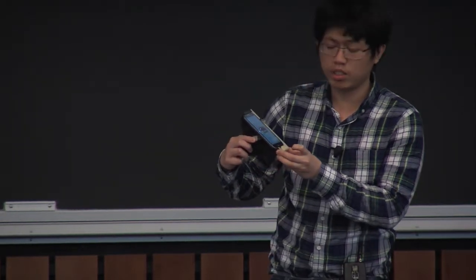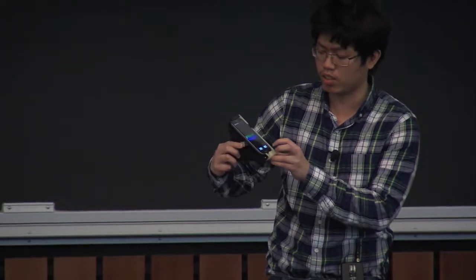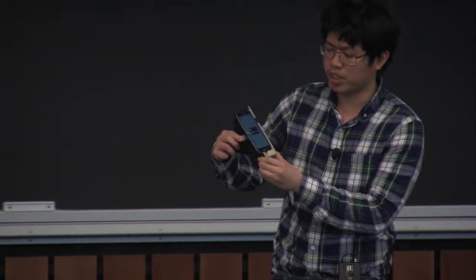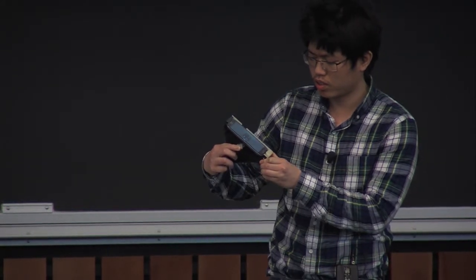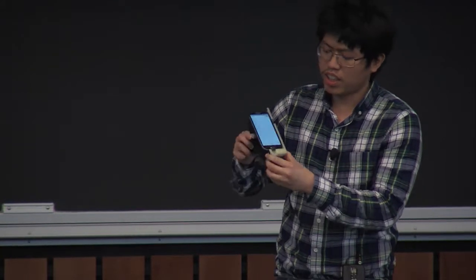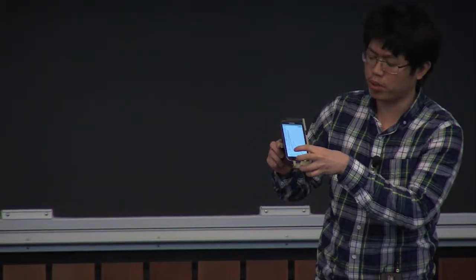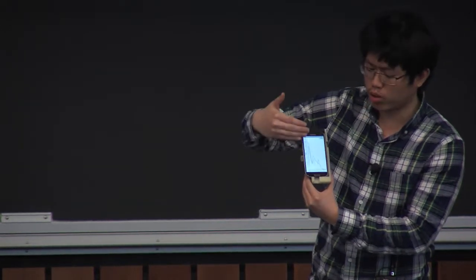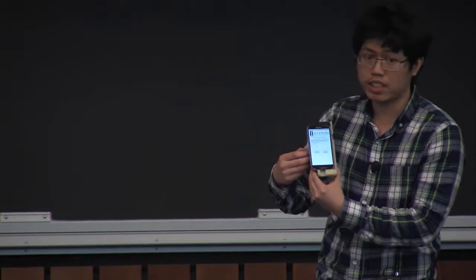It's doing averaging image because our detection has noise in it. And it is processing the spectrum right now. So we can see that here we have a spectrum of red, green, and blue one, and the black one is we just sum the total of spectrum here. So here we will demonstrate with the sample.